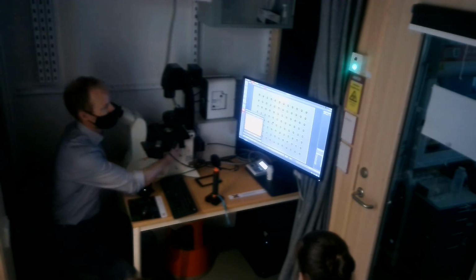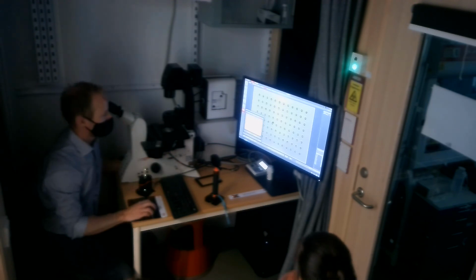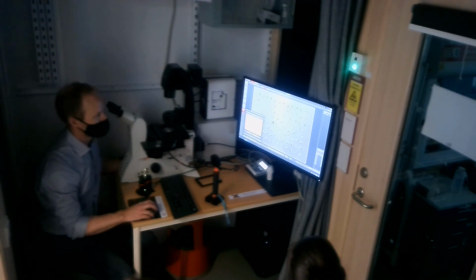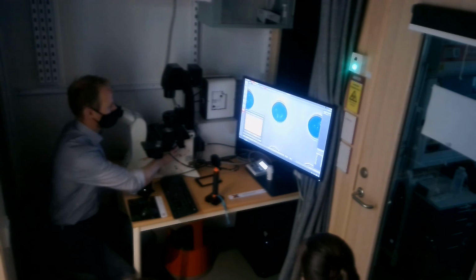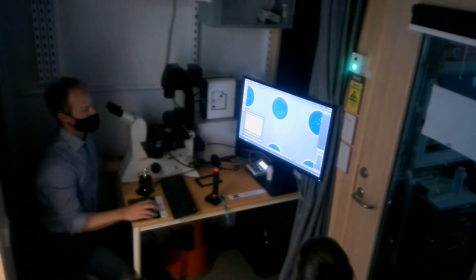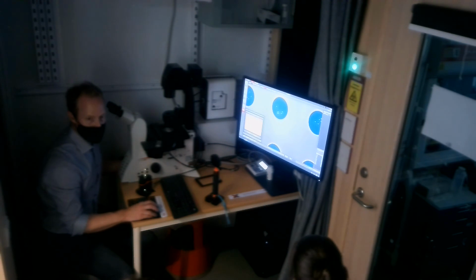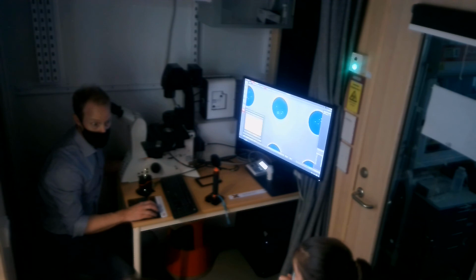So now I'm on the 5x objective, and in this 96 well plate, then I can fit 5 of them. So let me do that again with the 40x. So you can also see that this is also, of course, following. So if I change now to the 20x, this will be bigger, but at that point they may also overlap. So once you set the number, it's good that you are on the objective that you want to capture, actually.